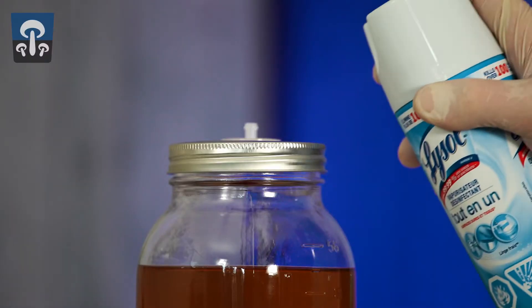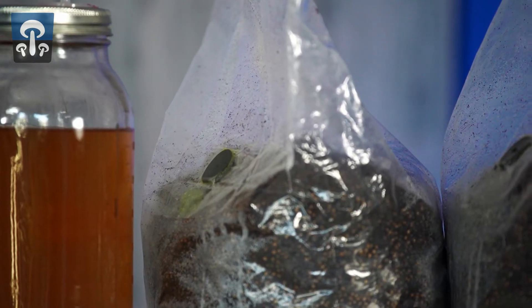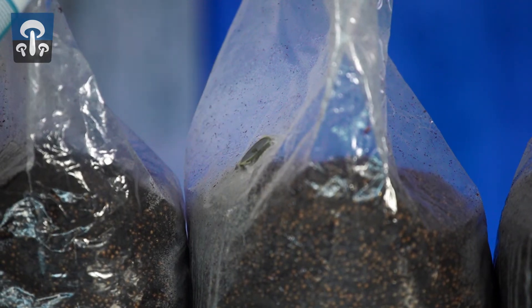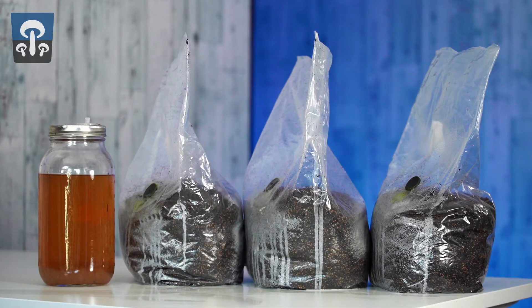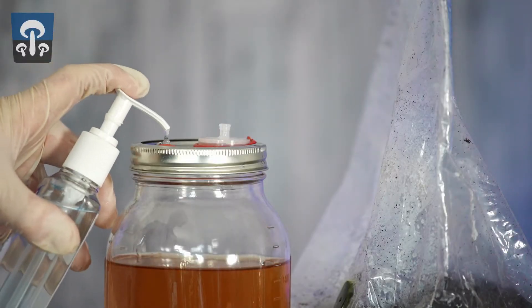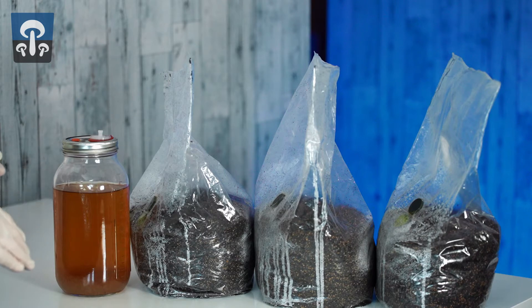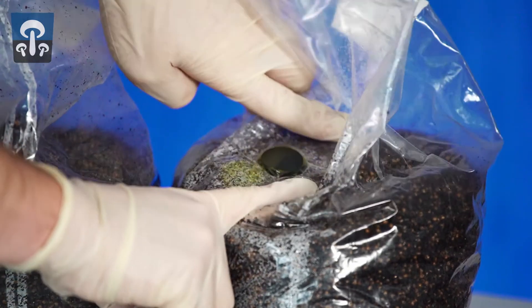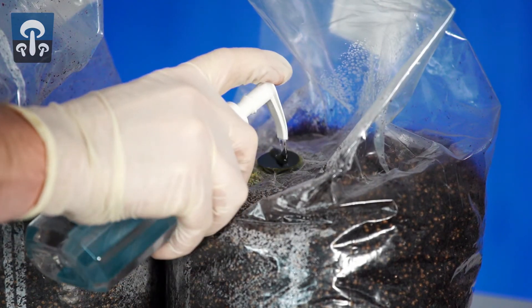The first step is to spray the inoculation port with Lysol. Allow them to stand for 10 seconds while they marinate in Lysol. Add a glob of Purell to the inoculation port on the jar. To add a glob of Purell to the inoculation port on the bag, you must rearrange the port so that it's prone — that way the glob won't run off with gravity.